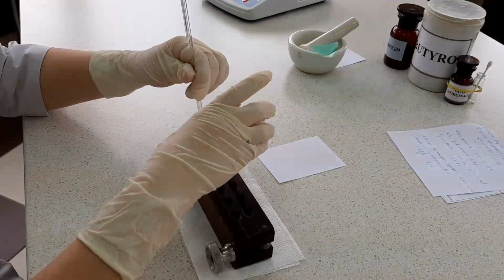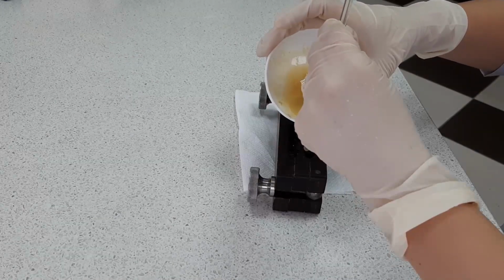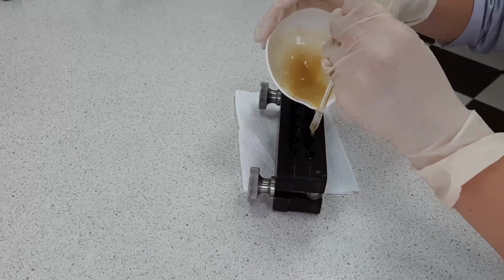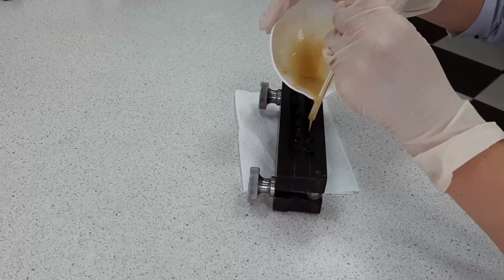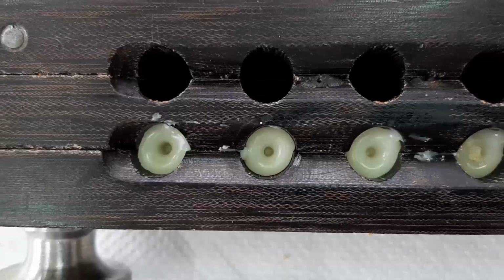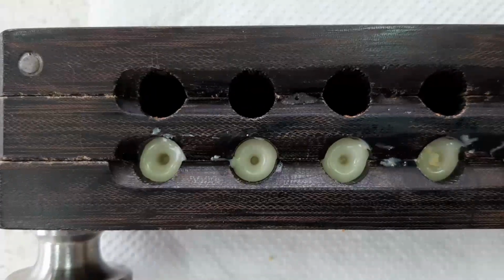Pour the suppository mass into the mold cells. The feature of butyrol is the formation of an air core during the gradual cooling of the base.